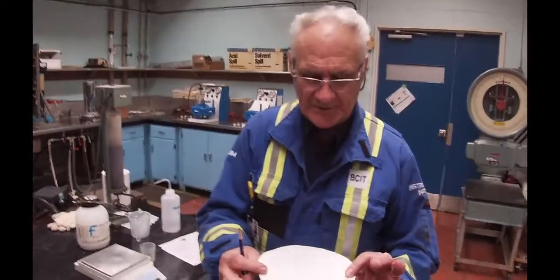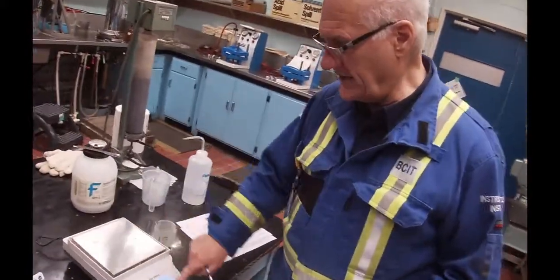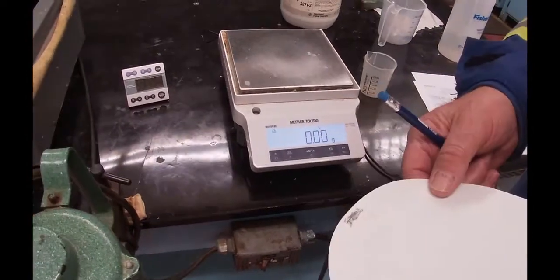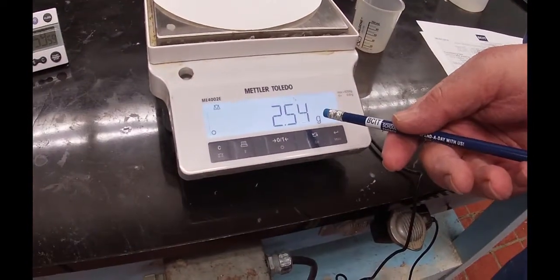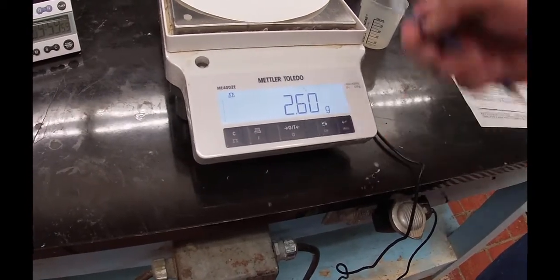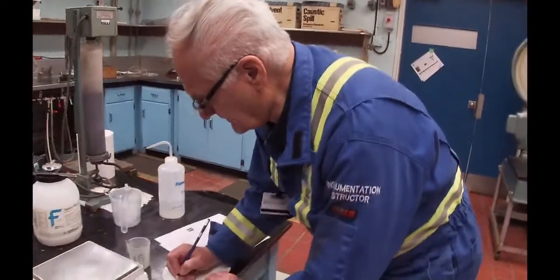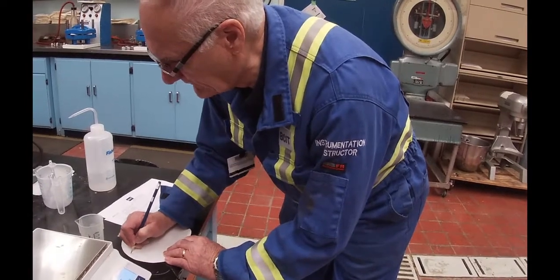So I'm here with the filter paper. Somebody has already written some weights on here, but they got them wrong. So I'm going to tare that out — the scale is going back to zero. It's measuring at 2.5859 — call it 2.60. So this is 2.60 grams equals the filter paper weight.